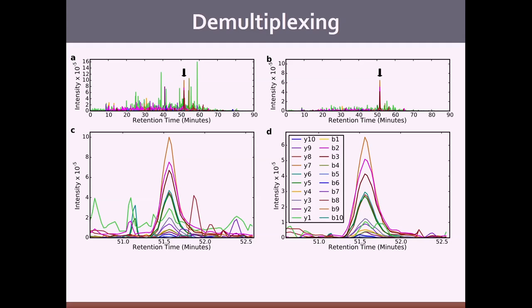So this is basically 20 mass-to-charge of data measured in each individual scan. We're, of course, multiplexing and randomizing the five 4 mass-to-charge wide windows in any one scan. And in this case, we're applying this non-negative least squares to demultiplex the data down to a much cleaner chromatogram. Okay, I'm going to show a couple other comparisons here.